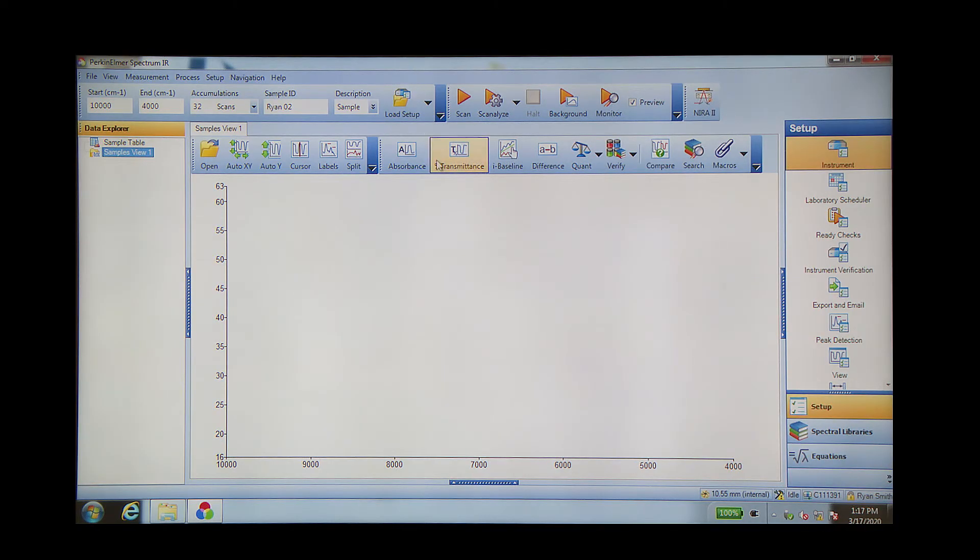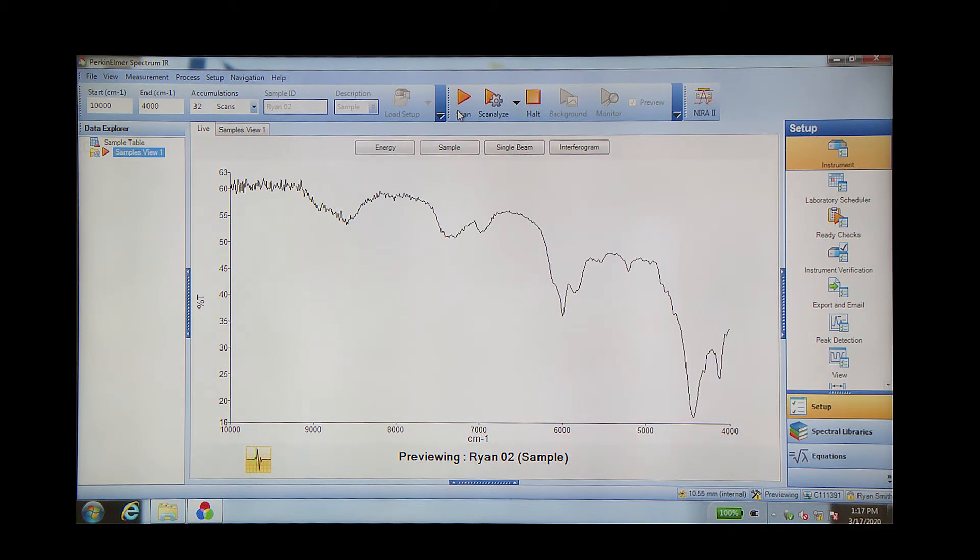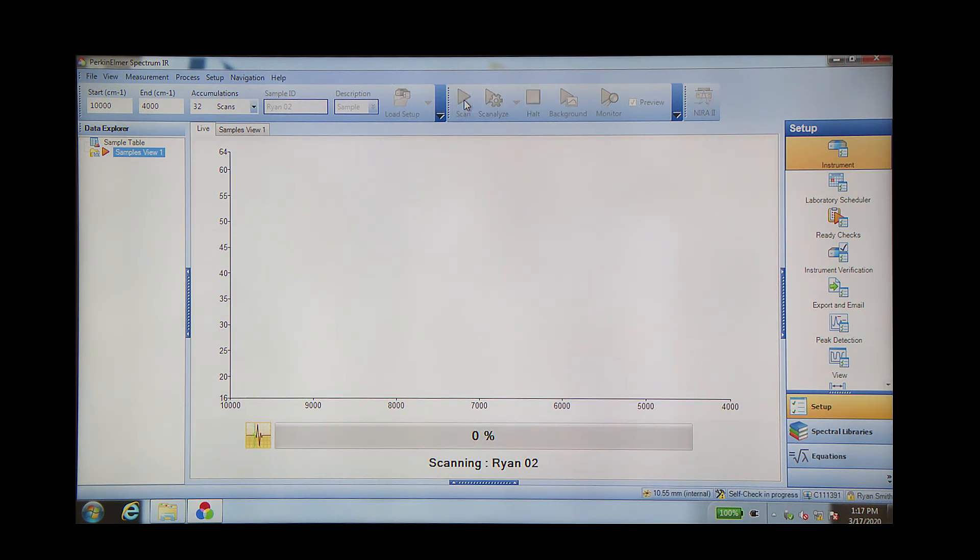Once we have our sample information entered in the software, we press the Scan button. The software provides the option of viewing a preview, which will show the near-infrared spectrum as measured in real time. If the sample is positioned correctly, we will see a usable near-infrared spectrum. Once we're happy with this, we can press the Scan button again, at which point we will go from the preview to measuring and saving the sample spectrum.